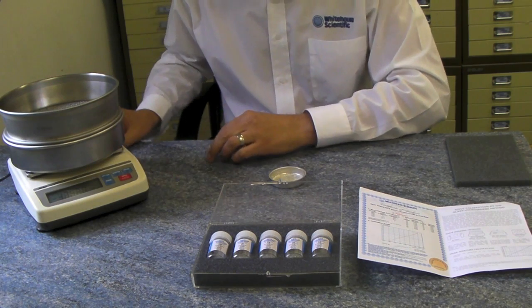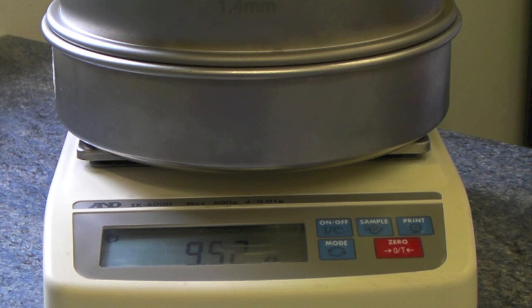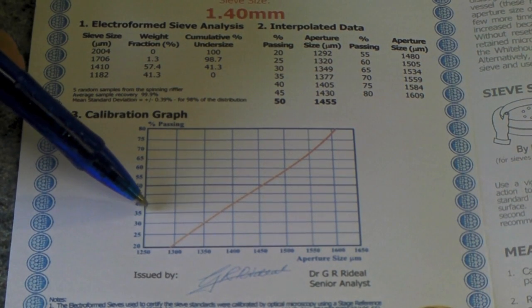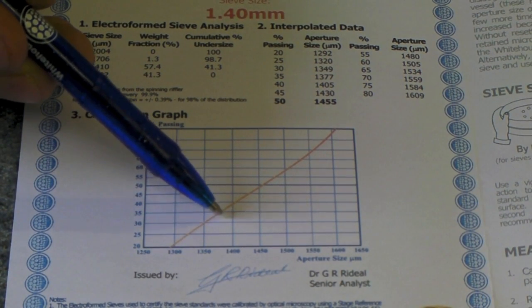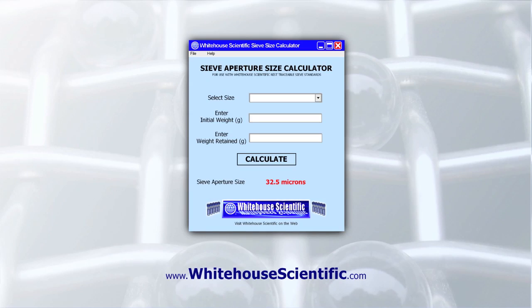Re-weigh and record the retained weight of the standard. Subtract this value from the initial weight to give the weight passing and convert to a percentage. Using the calibration curve provided, read off the mean aperture size of the sieve. Alternatively, use the free sieve aperture size calculator available from White House Scientific.